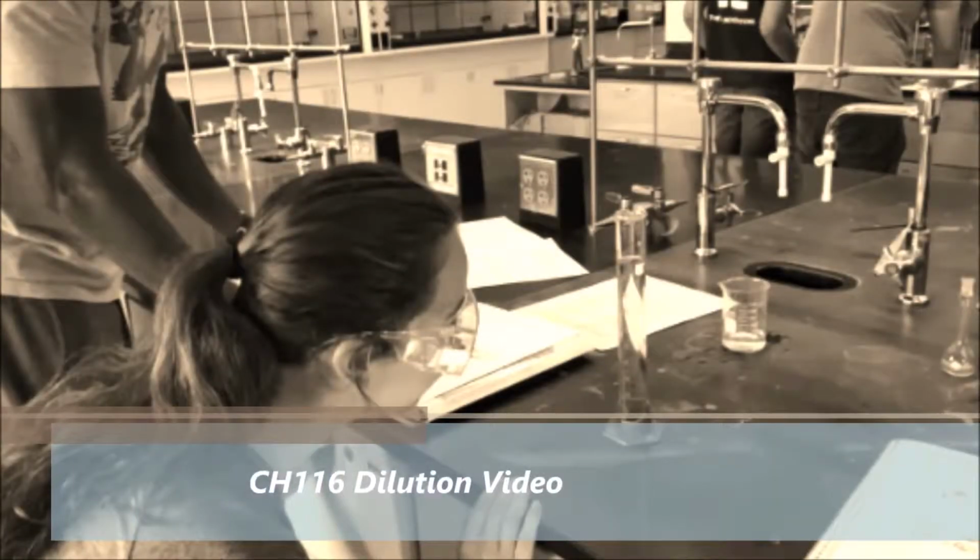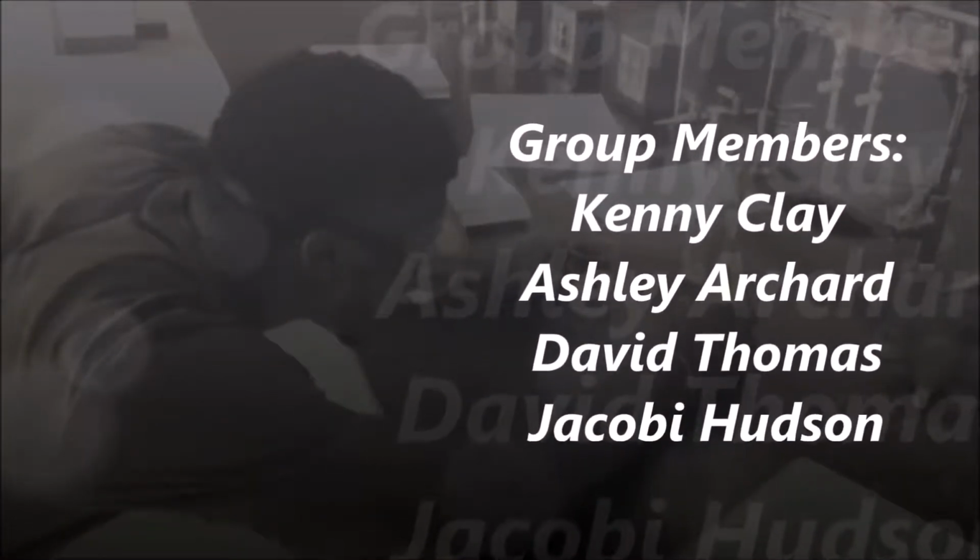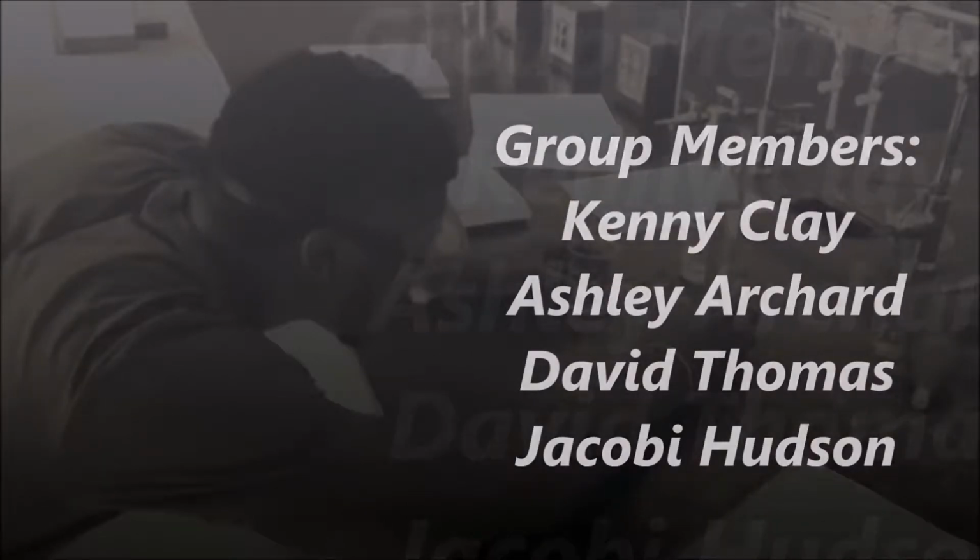Welcome! This is Everyday Life, and in this video, we will explain and demonstrate how we used proper lab techniques to find the density of water and dilute a solution. Closed-toed shoes, pants, a shirt that at least covers the shoulders, and safety goggles complete the proper lab attire that must be worn.